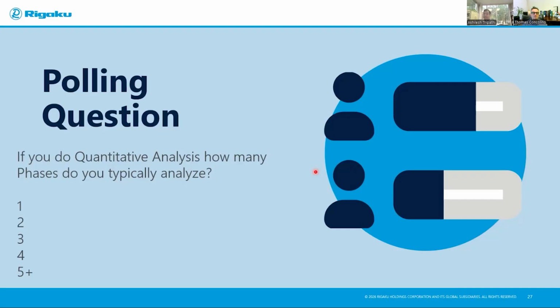Let's say you mix quartz with salt 50-50 and see how close you are, because you are adding 50% of both. So you can relate how close the result is between the two different formats, and that will give you a lot more confidence. I always tell a beginning user to prepare a mixture by themselves and try this.